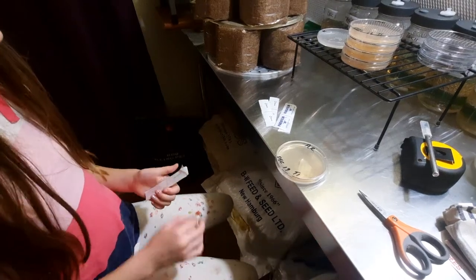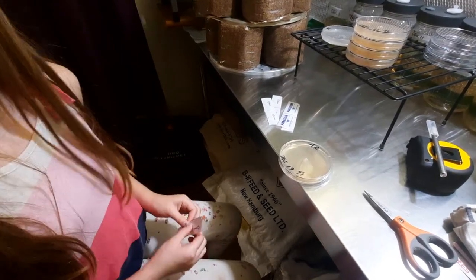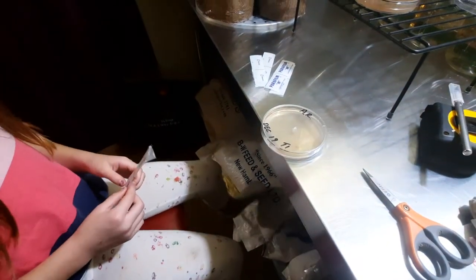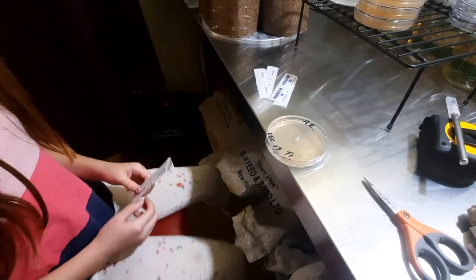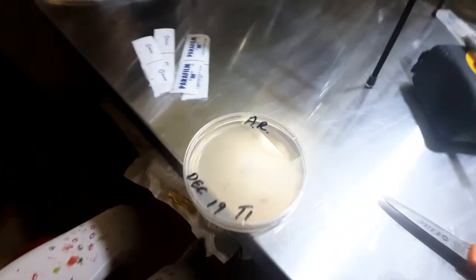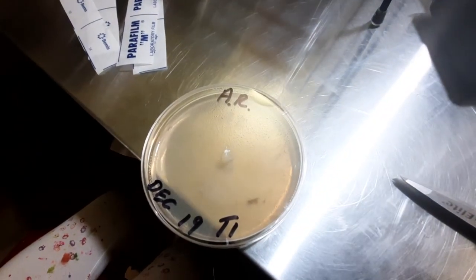Hello everyone. It's my seven-year-old daughter. We have pre-peeled some parafilm. She is going to wrap one of my 90 millimeter by 15 millimeter agar plates with antler reishi transfer on it.